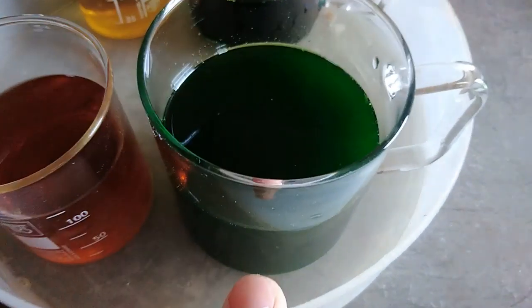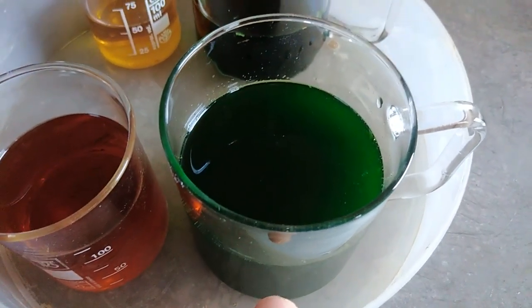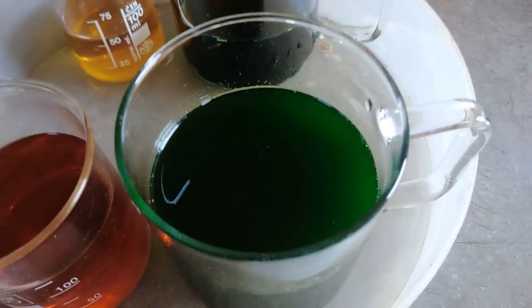And in this beaker I got my first solution from magnetic pins. You can see they got some green color.